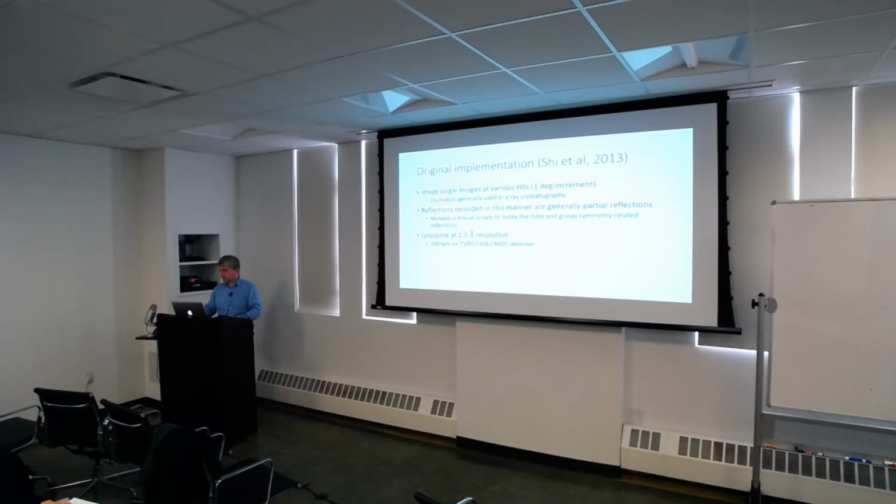I feel like that problem exists at the synchrotron too, doesn't it? I don't know. I mean, partial reflections. That's why you have to index, and merge and scale. I think it's worse for this, because even if you might be getting only partial reflections for some of them, at least some of them will be more complete because you are collecting a little bit of oscillation, versus just a completely flat image with no movement at all. Yeah, I think you're right. It is still a problem in X-ray, but I think it's better. It's all better worked out.